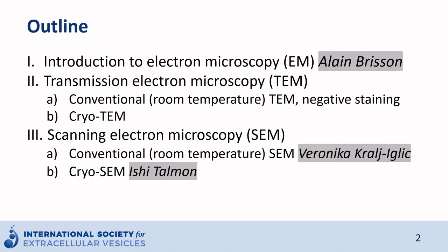First, a short introduction to electron microscopy, followed by the presentation of the two main techniques in EM, namely transmission electron microscopy and scanning electron microscopy. And for each technique, distinction between the conventional methods or room temperature methods and cryo methods.